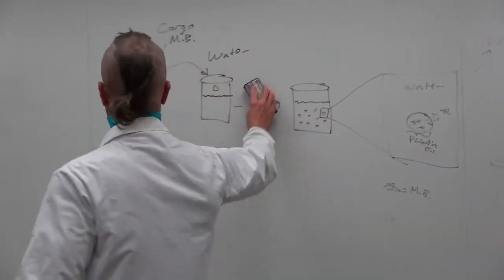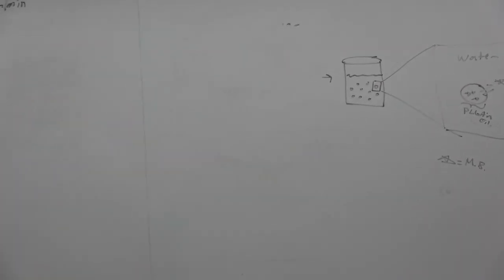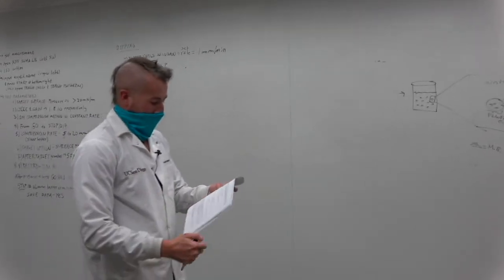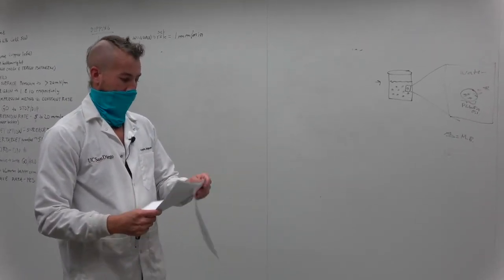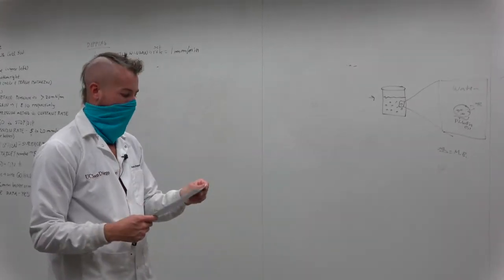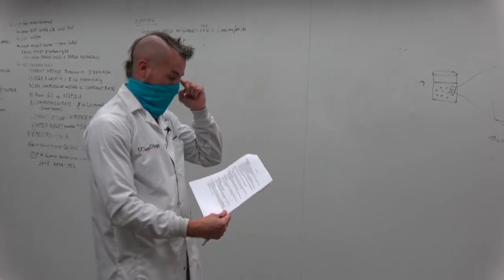The next step, like so much in nano, is to centrifuge it. So this would now technically be day 2. This is part 4 on your handout.